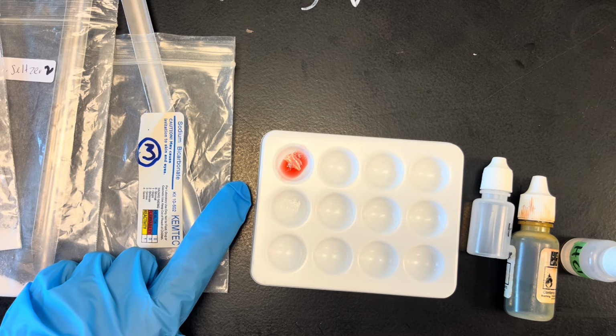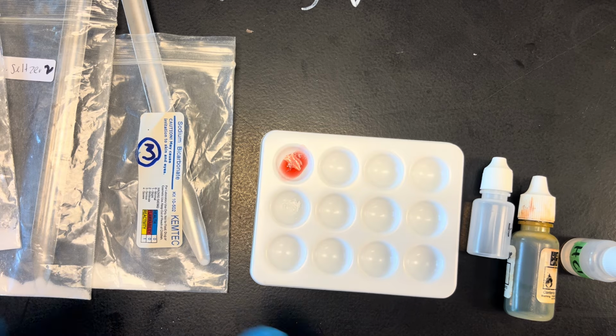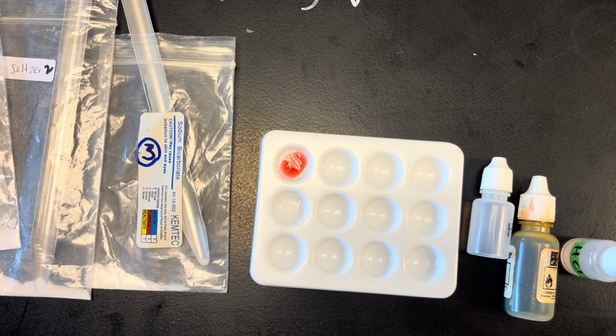Make sure you're only using small amounts. If you finish all 5 substances, then I'll let you check the 5 substances with a black light. I have another set of bags that you can test with the black light. Okay? Make sure to wear your safety glasses and make sure to participate actively.